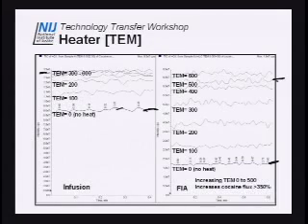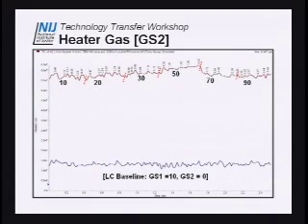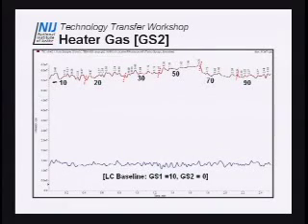We don't run it much above 500. You can see there's not much gain between 500 and 600, but 500 is about where we max it out. Alrighty, gas 2. To be honest, gas 2 is how much pressure is coming out, how much gas flow is coming out of the hair dryers, and you can see it's pretty flat. It tends to go, and this is the FIA.